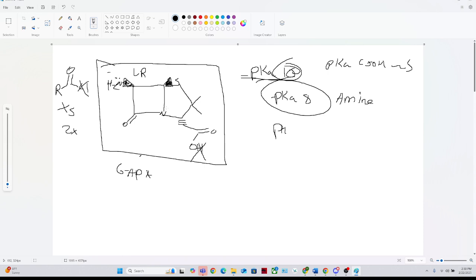Also, more importantly, the reason I don't add the acyl chloride in before I add my 6-APA is for another reason. The acyl chloride is also an activated carboxylic acid derivative, and it means that it's prone to hydrolysis, unfortunately. And so in order to ensure that my excess reagent isn't going to get used up prematurely as well, I want to add my limiting reagent in first that is a little bit less prone to hydrolysis. It's still kind of prone. I mean, amides are typically more inert to hydrolysis compared to acyl chlorides, but the 4-membered ring component of it could be an issue.